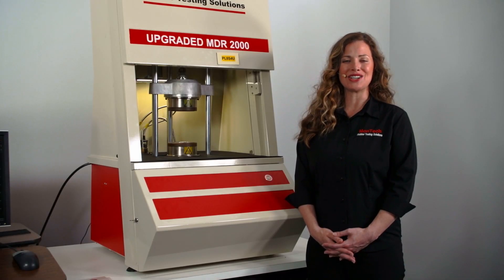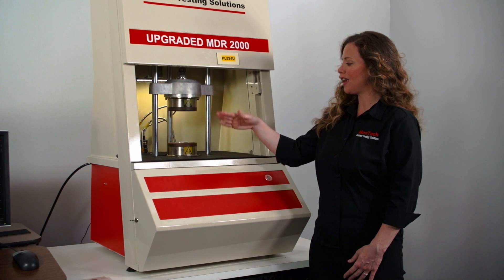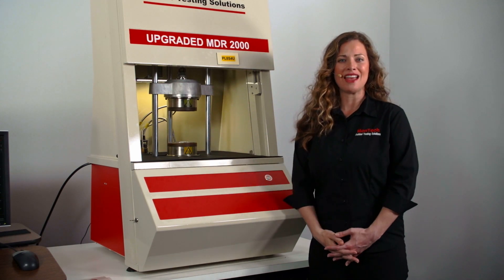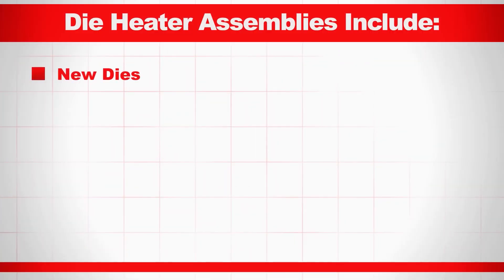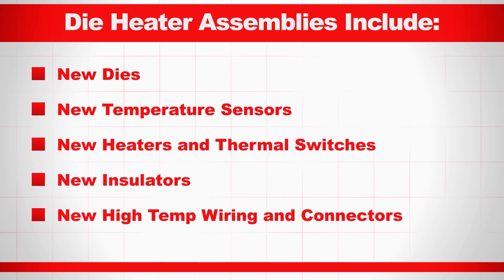Next, we install new die heater assemblies in both the upper and lower platens. This includes new dies, temperature sensors, heaters, thermal switches, insulators, high-temper heater wiring, and connectors.